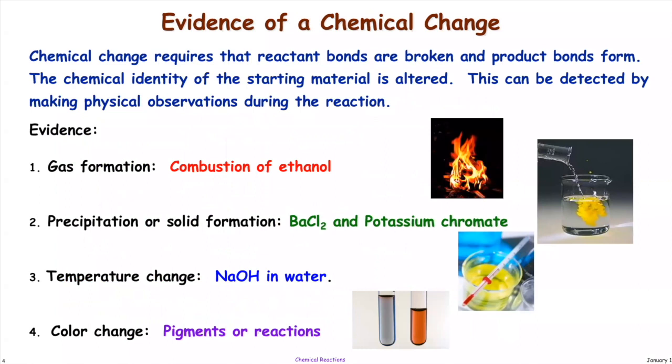Okay. And so hand sanitizer burns just as well? If you look at the ingredient, 65% ethyl alcohol, ethanol, 65%. So yeah, it'll burn. Okay. So and now again, when we get to that point, I'll show you.